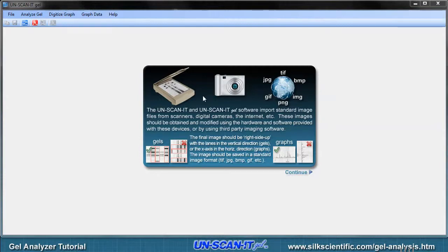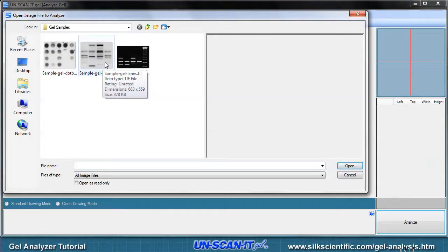The image to be analyzed should have the lanes or bands shown in the vertical direction on the image. For this tutorial we will choose a sample TIFF file.